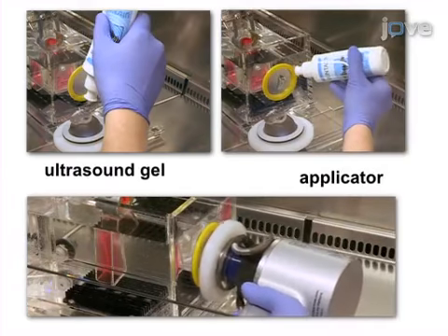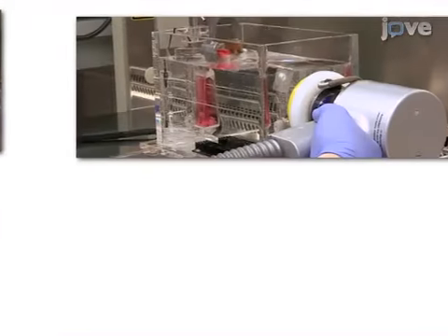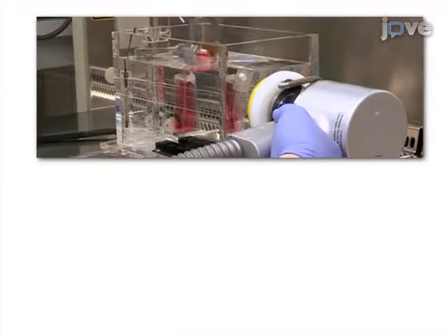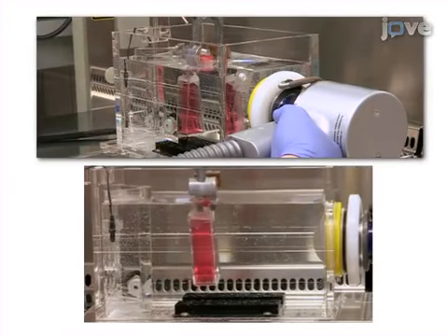Next, the applicator is placed against the water bath's membrane in a horizontal manner. The final step is to ensure that the shockwave source is in line with the center of the cell culture flask in order to have the cells positioned within the wave focus.